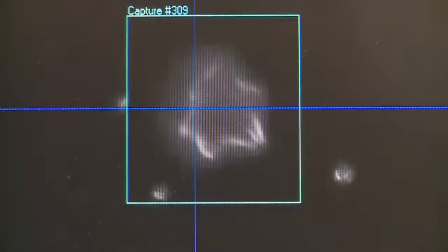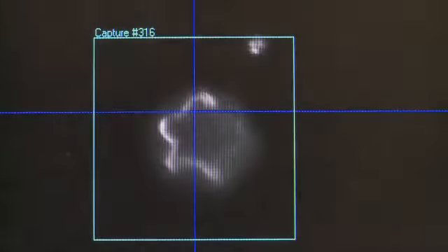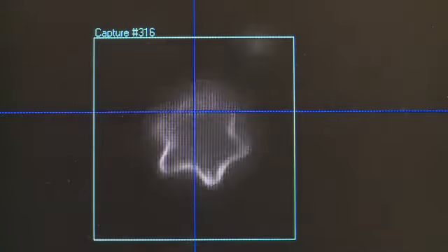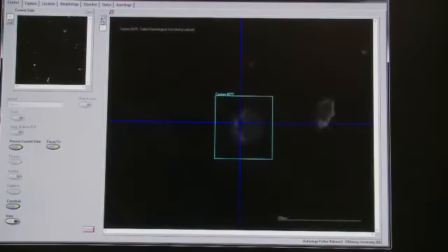So the microscope lens will actually go over that slide and take a low resolution picture, and then it will shift to a second lens, and under high magnification the microscope will then take images of the pollen grain right from the top down to the bottom, and then takes 9 images and stacks those images together, a bit like a pack of cards, and those 9 images will then be transformed into a 3-dimensional image of the pollen grain.